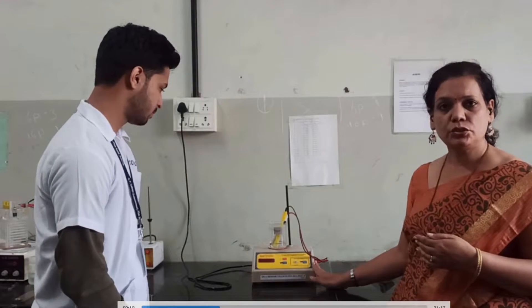Welcome back to Dr. Suchitha's interactive class. Today we are going to see one of the instruments which is being utilized to measure electromotive force, or EMF, of a galvanic solution where chemical energy is converted into electrical energy. This is possible by utilizing a potentiometer.